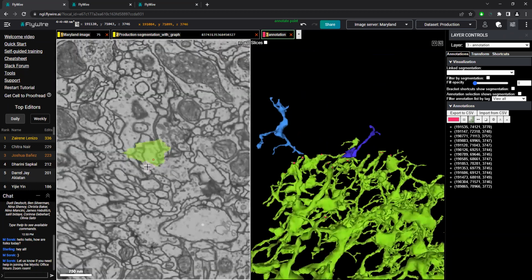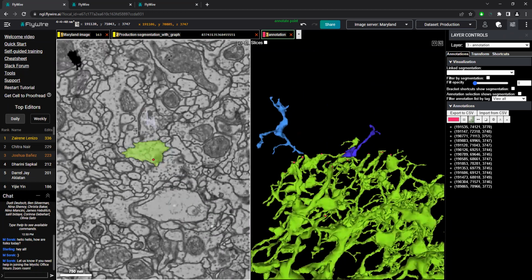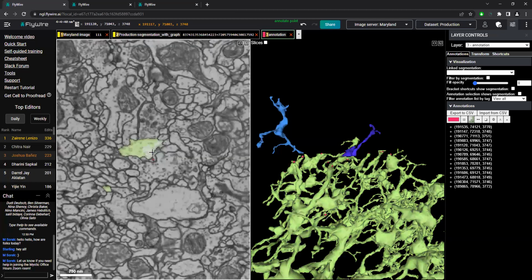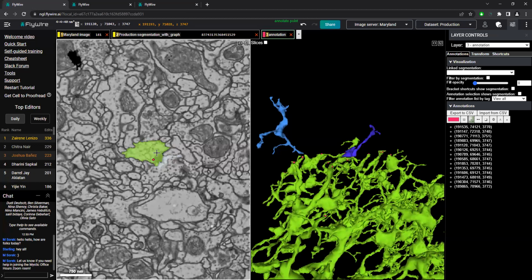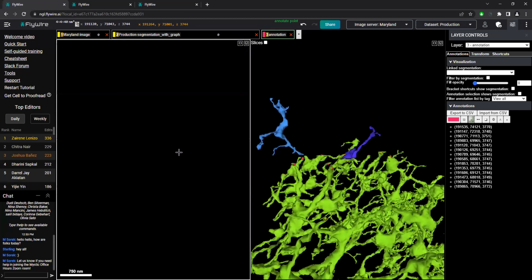And the reason I know it is, I'm looking at some of the surrounding structures that are going on around this piece, and the fact that it has a lot of intercellular structures in it. So yeah, obviously this is a little messed up, but we see this structure getting a little bit bigger from when it was before in this piece.